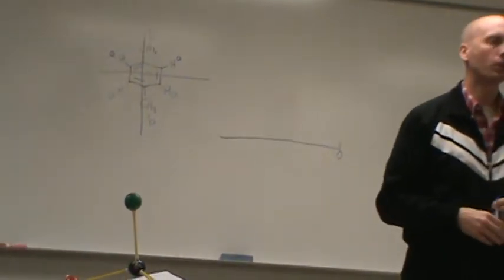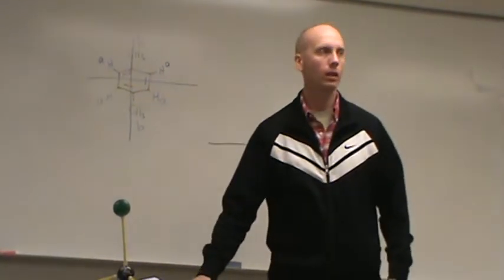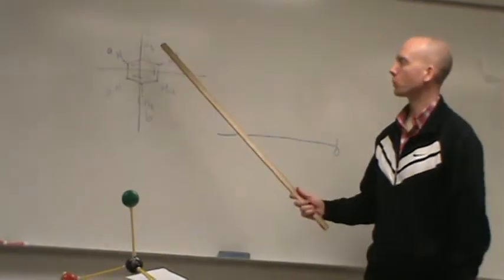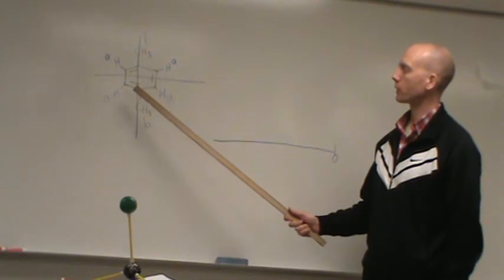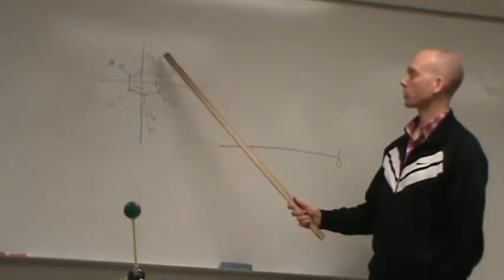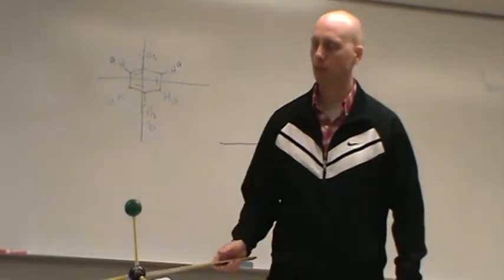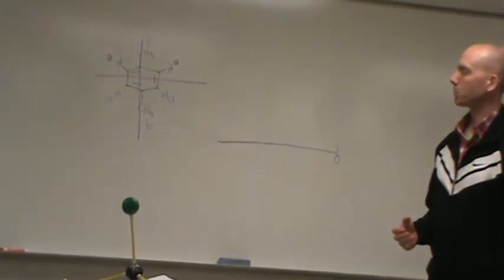So you see how this one differs from the one we did last time. This is para-substitution. Okay? But the para-substitution we did last time, we had 2 different groups. And so that threw off the symmetry going that way. But now when the 2 groups are the same, we get that extra symmetry, so it's going to condense our number of peaks. So we get 2 different peaks, A and B.